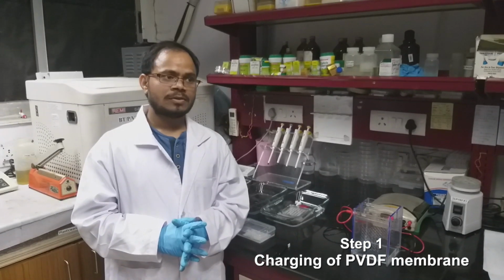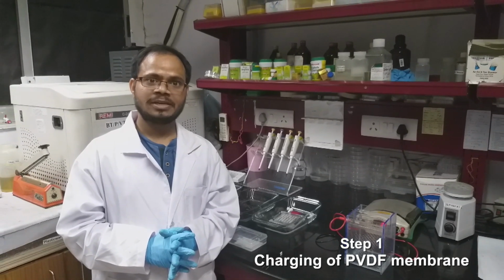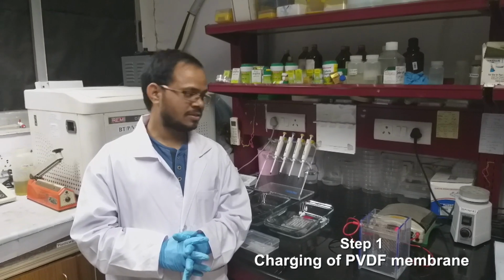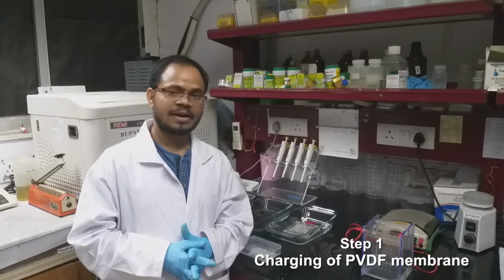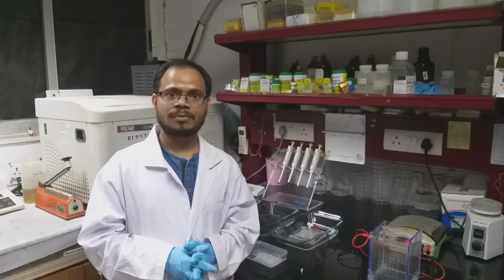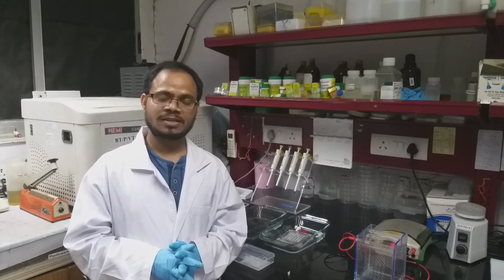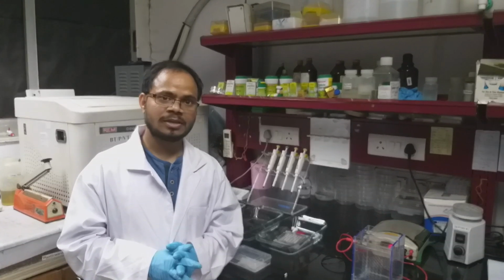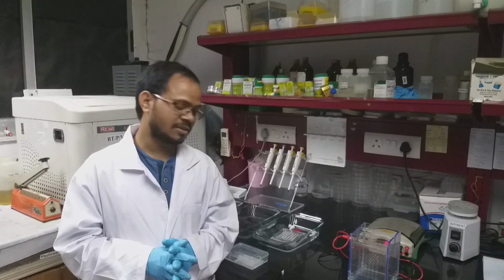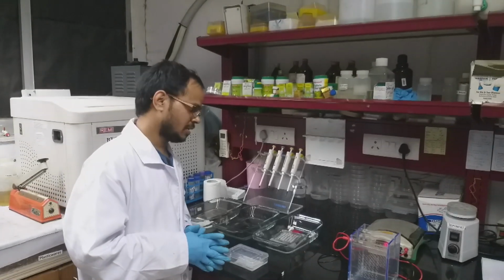While doing the transfer, we need to consider a few things. The buffer should always be in chilled condition, otherwise during the transfer at high voltage it will generate high temperatures, which may degrade your protein or decrease the efficiency of the transfer. That's why we need to keep the buffer always chilled. And let's start the procedure.